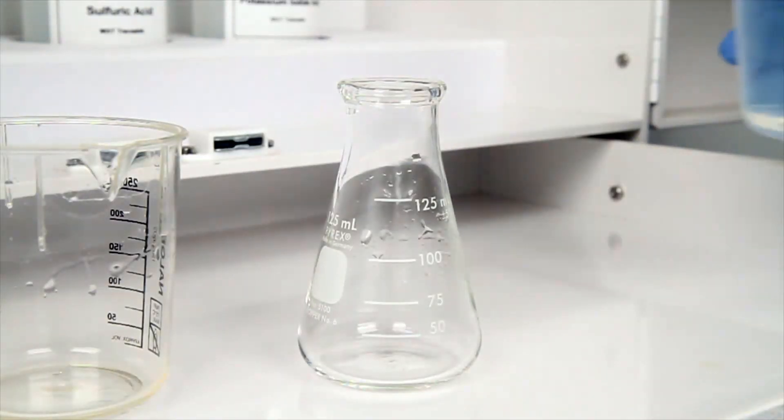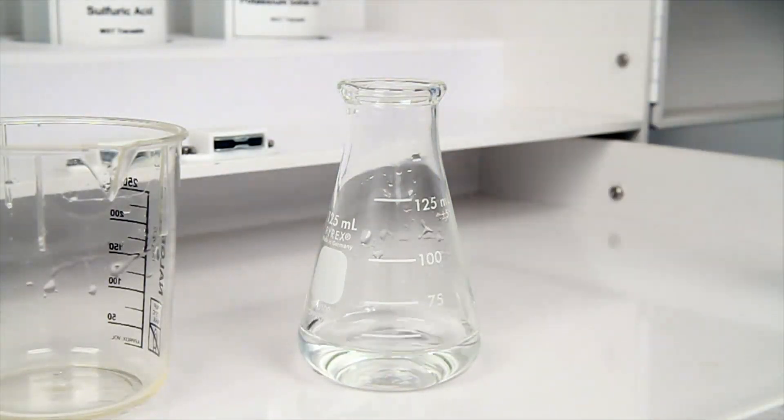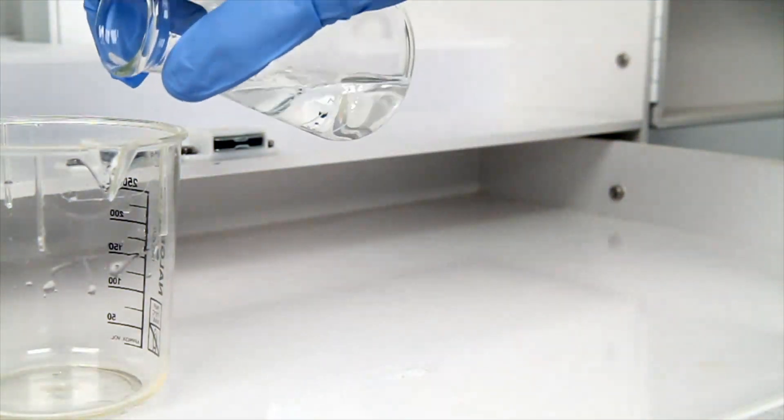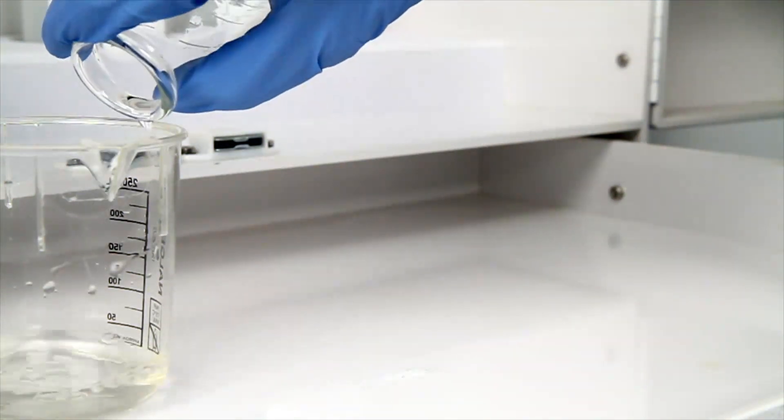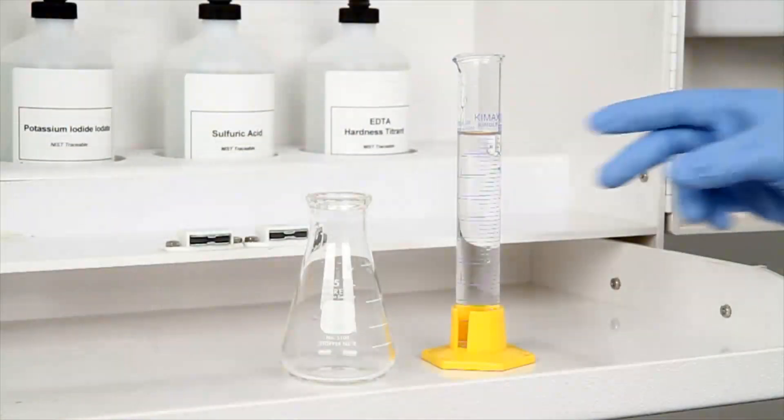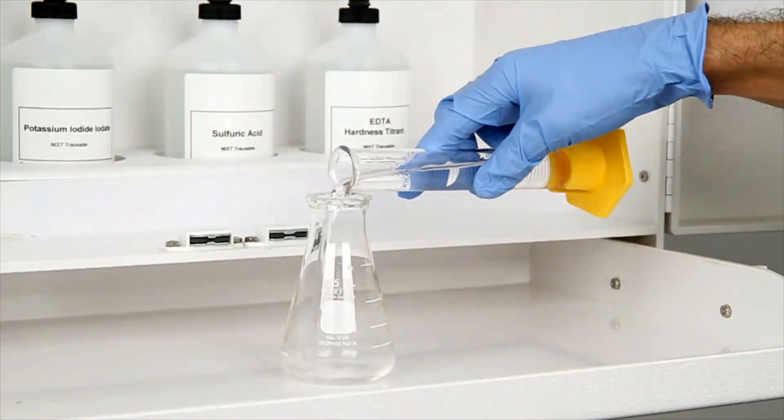Next, gather your sample. To prevent contamination from a previous titration, rinse the flask with the sample to be tested. Then, use a graduated cylinder to accurately measure your sample and add the sample water to the flask.